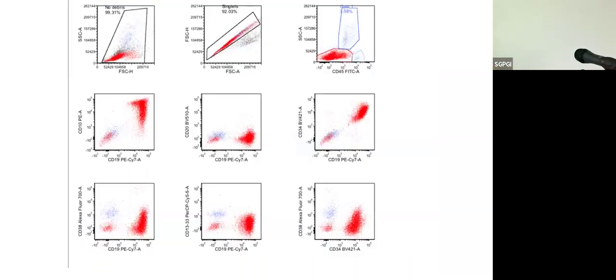We went on to do a flow cytometry. Here, Dr. Sadiq was showing you something. What are these? This is the blast, right? If I just show you this graph, what would you think of? Probably B blast. Yeah. So a negative to dim CD45 and a low side scatter. So the B blasts were confirmed. They were CD34 positive, CD19 positive. No issues here. Expressing CD38. CD20 was negative. That is expressed by more mature B cells. The CD10 was positive. So fine.